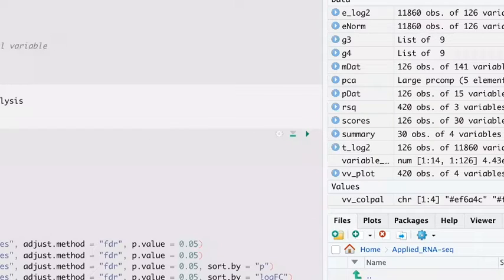So now we're going to turn to differential expression analysis. We're going to use the package called limma, which again was built for RNA-seq analysis. You can also use the DESeq2 or the edgeR packages. They also have their own methodologies of using it. But limma has just been used in our lab, and compared to DESeq2 and edgeR, it returns fewer false positives.